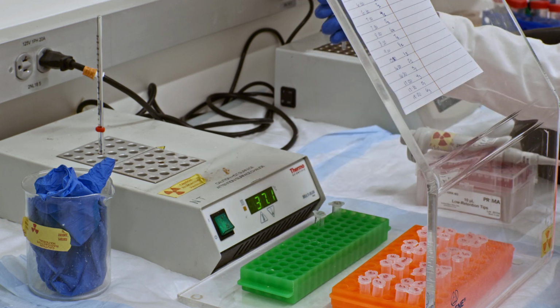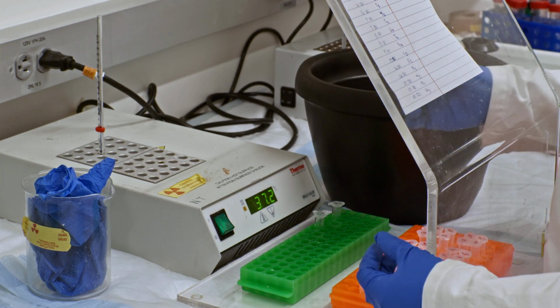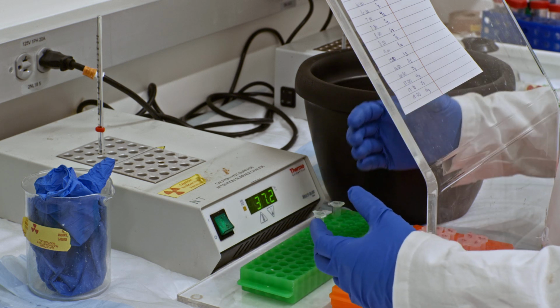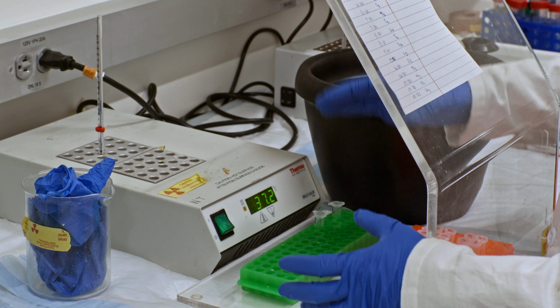After your overnight incubation, or your 2.5 to 3 hours of letting the DNA, primer, and template strands come together and anneal, the next thing to do is to actually run your polymerase assay. So here's a few things you need to know. Most of the components of these reaction vessels will be done outside of the radioactive room.